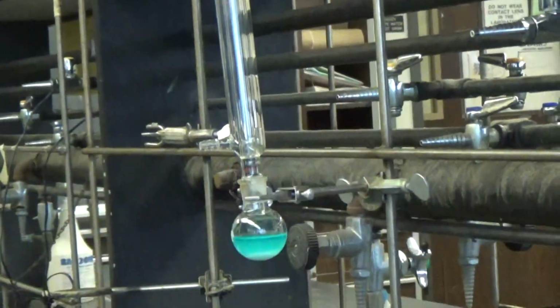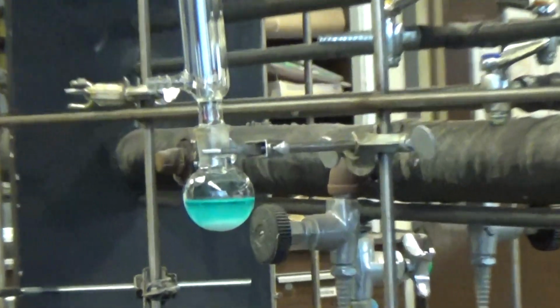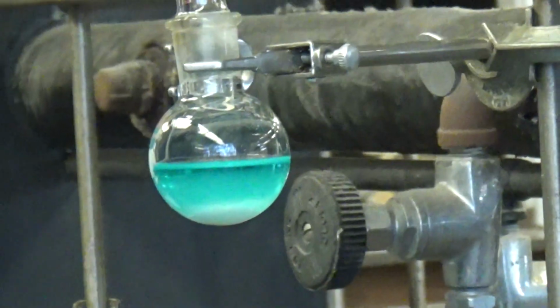Now, the condenser. The setup has to be done well here. Then the hot plate, and bring that up.